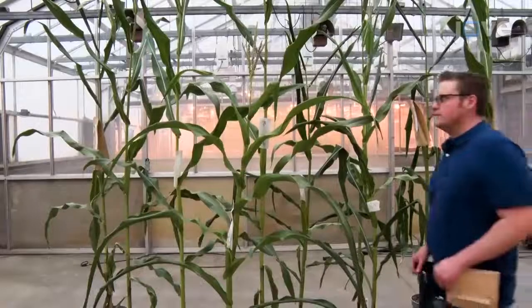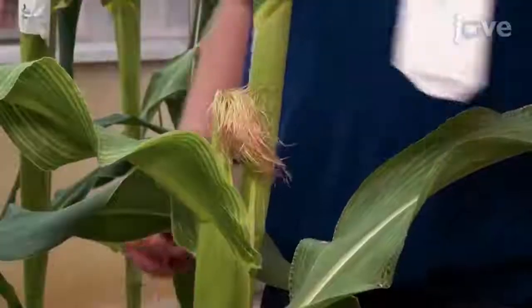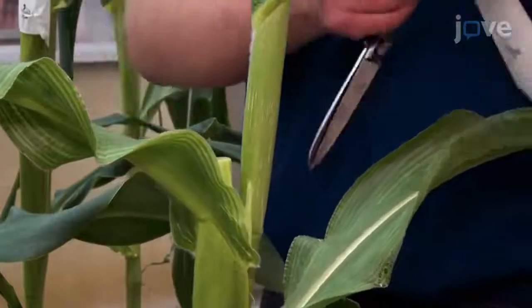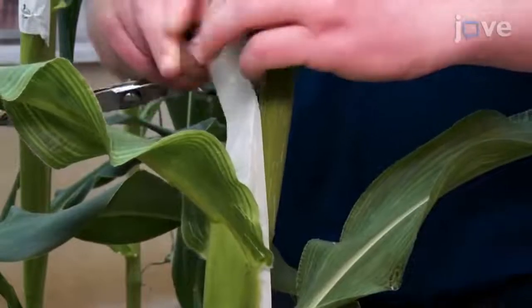About two to three days after silks have emerged, and if pollen will be available the following day, cut the silks and husk with 70% ethanol-sterilized scissors roughly two and a half centimeters below the end of the husk leaves where the silks emerge, and cover the silk with a shoot bag.